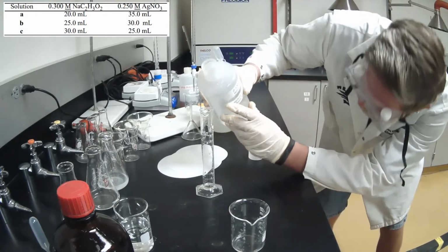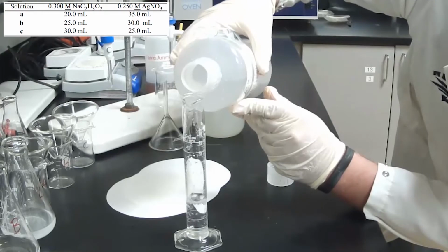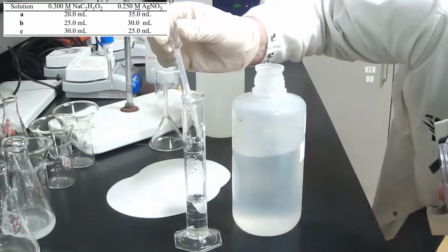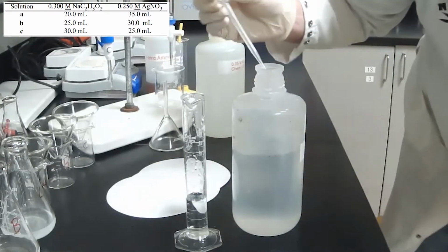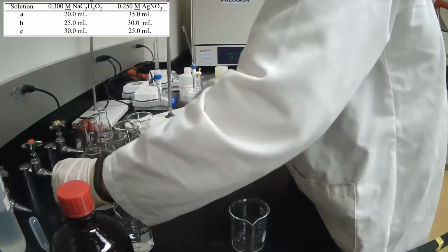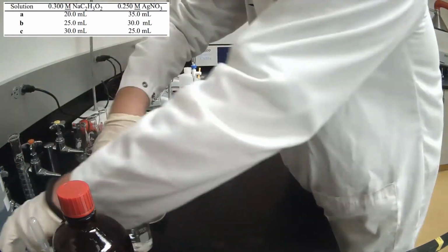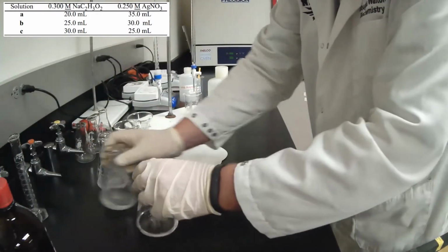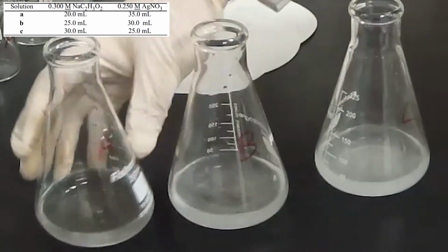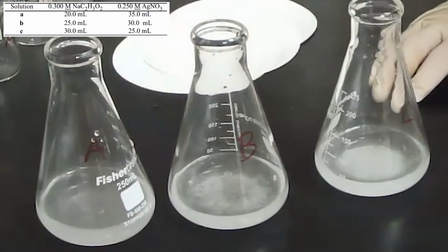Into Erlenmeyer A. All right, so we already have some death glitter forming in C. Wants us to stir them until it begins, so I think we've got some precipitation going.